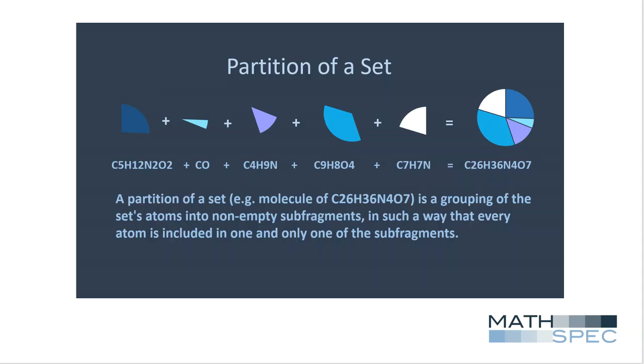Possible spatial alignments are then assigned based on logic tables. From the alignment, we can picture the analyte as a modular structure. Let's demonstrate the Excel add-in using some methionine data as a simple example.